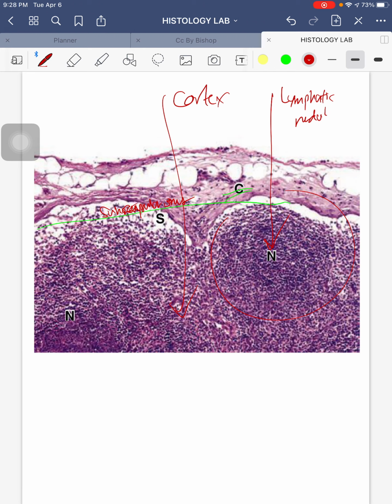Okay. There's no germinal area present, so this is a primary lymphatic nodule. Identify the structure. There are no Hassall's corpuscles in the cortical area, subcapsular space, and so you'll answer lymph node. Okay, so if you notice, unlike the thymus, there are many spaces, or invaginations, which are really evident, but here not so much in the lymph node.